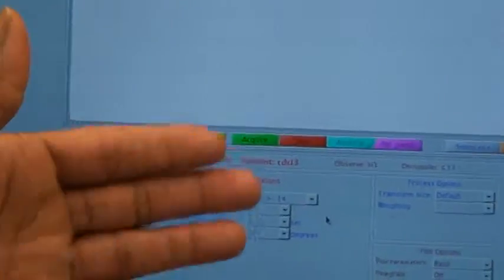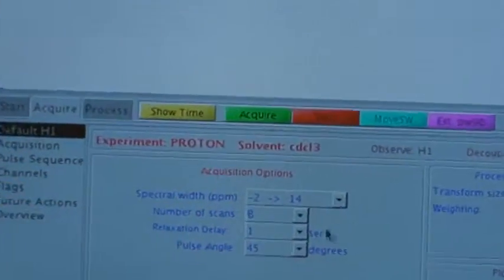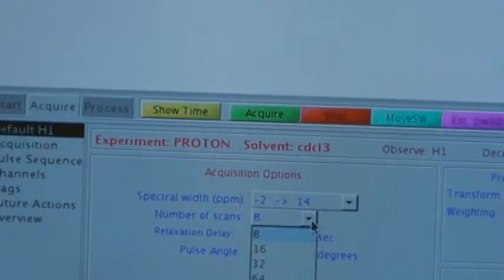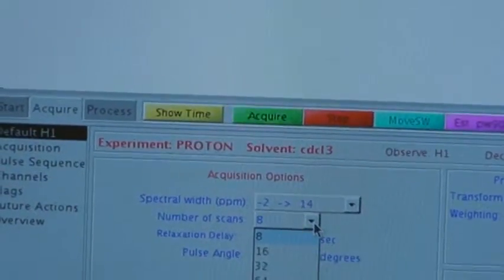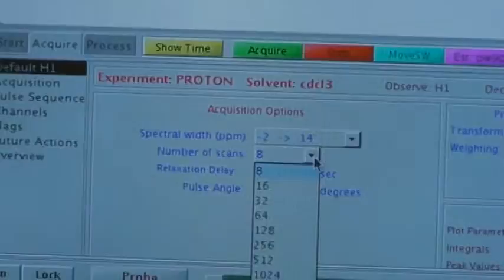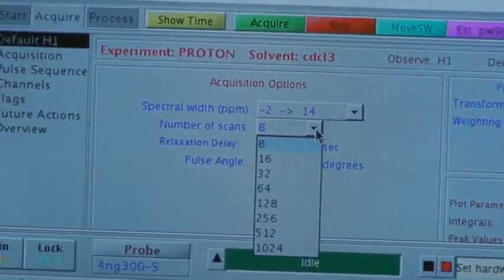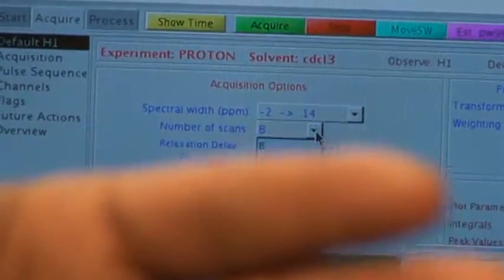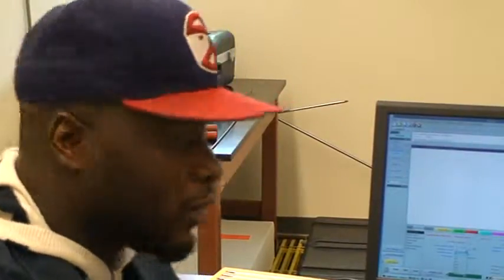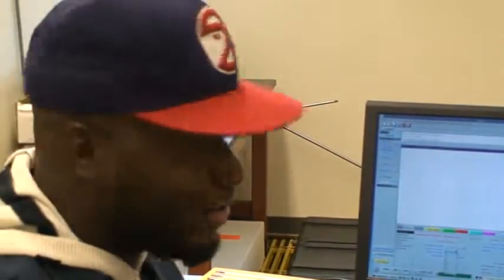In Acquire, we can choose the number of scans, and today we're going to do eight scans. Keep in mind, the more scans that you choose, the longer it takes. But the longer it takes, the clearer the peaks. So that's for you to decide how many scans you want to do. The more scans, the less noisy spectrum you will have.